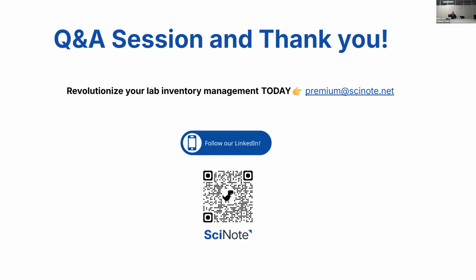And I see there's another question. Murden, is there a section for requesting the purchase of reagents, chemicals, for the purchasing department? Yeah, you could set up the same thing. SciNote has a quite nice system of notifications and tagging people, the team collaboration part of it. So they would get an email that they were tagged on, I don't know, a specific sample, and when they log in, they could see the message that they need to reorder it. So yes, this is possible.